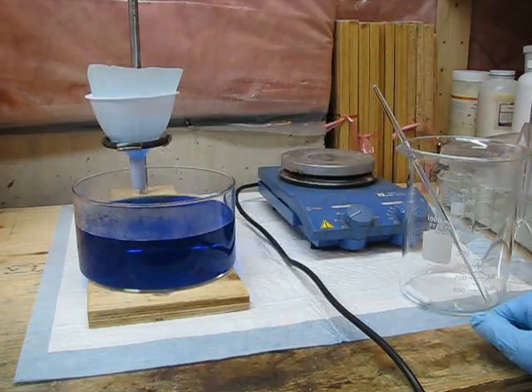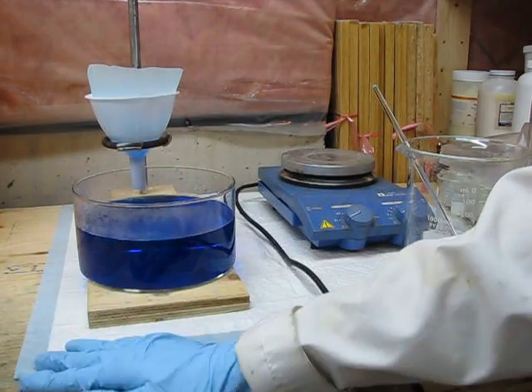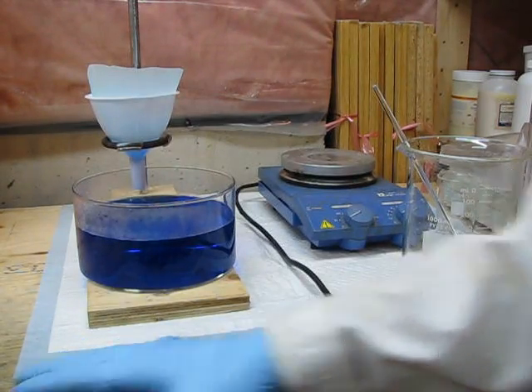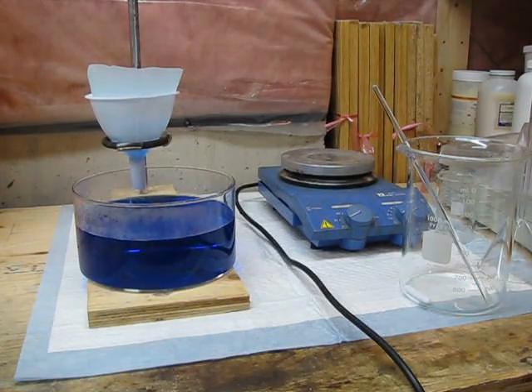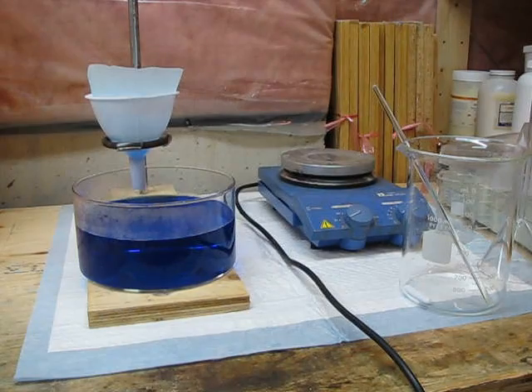The other problem with it is that since it's plastic on the bottom, it is vulnerable to organic solvents like acetone, ether, petroleum ether, mineral spirits, hexanes, and so on.